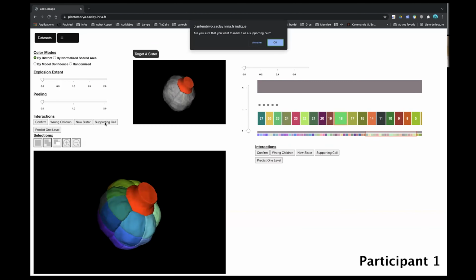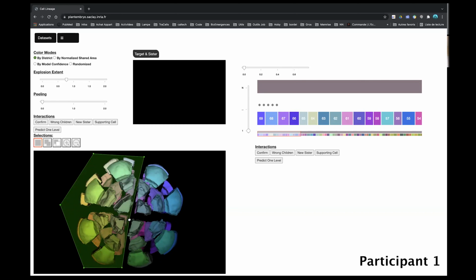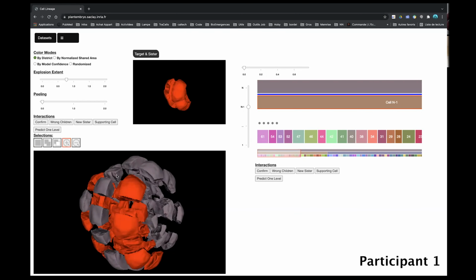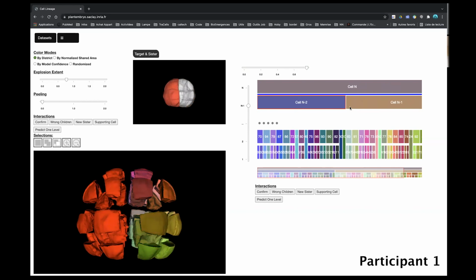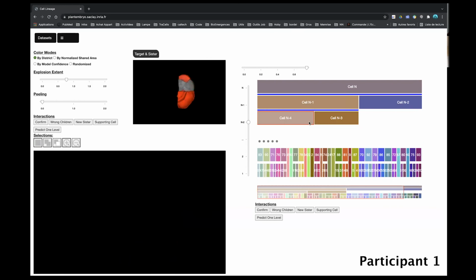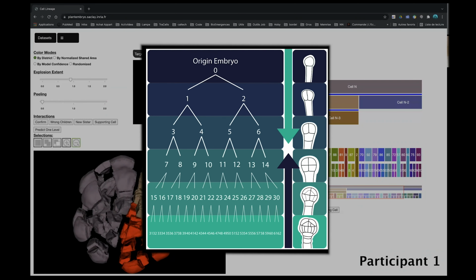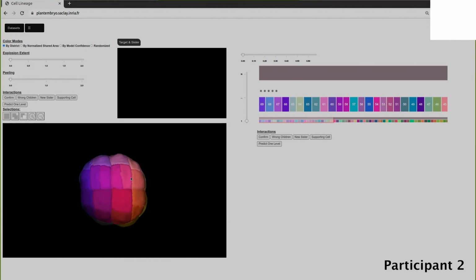We conducted empirical case study evaluations with 5 biologists and found that during the study, they were largely influenced by their past interaction habits. Also, the tight connection between 2D and 3D representations is essential and necessary for them to make assignments. Moreover, they all benefit from the 2 ways of establishing the lineage, bottom-up and top-down.